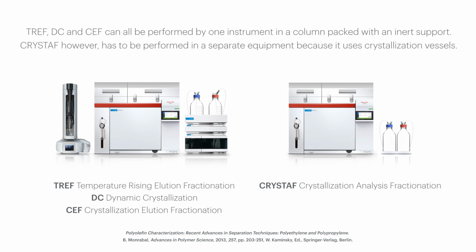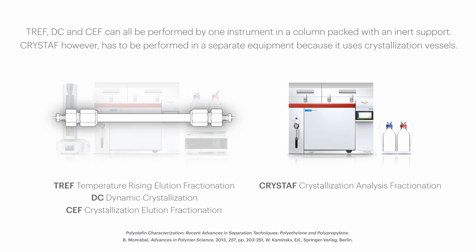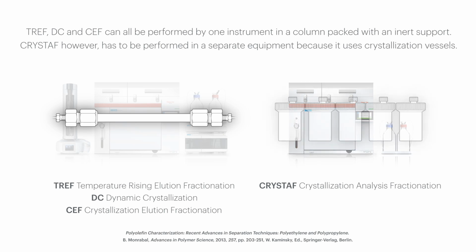TREF, DC, and CEF can all be performed by one instrument in a column packed with an inert support. CRYSTAF, however, has to be performed in a separate equipment because it uses crystallization vessels.